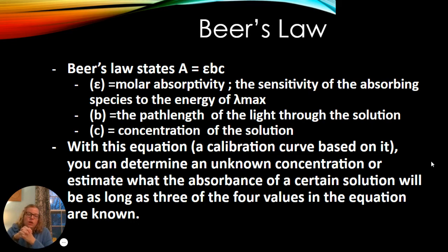And when you do your plot of absorbance versus concentration, the slope that you get is usually your molar absorptivity constant, as long as you have a 1 centimeter path length or a 1 centimeter cuvette in your Spec 20 or your spectrophotometer. So realistically, the molar absorptivity constant is that slope value divided by the path length, but 99% of the time, the path length is going to be 1 centimeter. So all it does is add a centimeter component to the unit, and I'll show you that in a second.